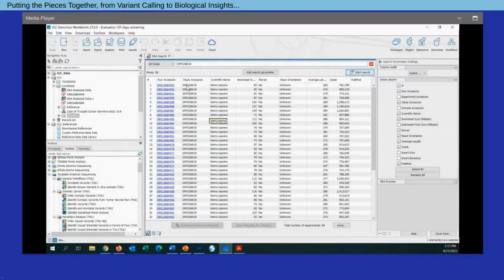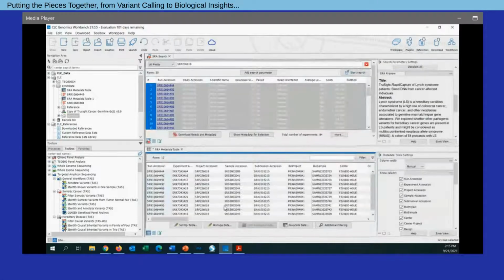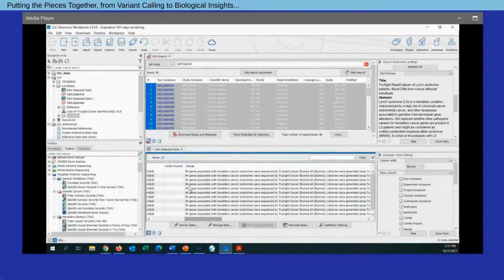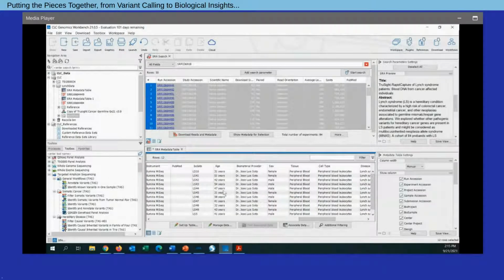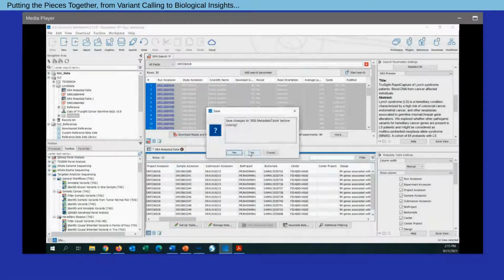And for any of them, we can first and foremost select them. We can show the metadata for these samples. So we have now a table for the samples I selected from the study, a set of descriptors, again, various accession information regarding the project. So here you can see we have a 94 gene panel that we're working with. And then in addition to that, as I would scroll further along this table, we will get sample specific information: the isolate, the age of the sample, the sex, and any additional details that might be included within this study. So that gives us some context to what these samples are.